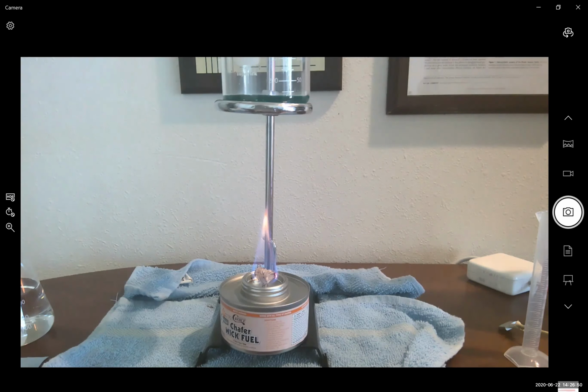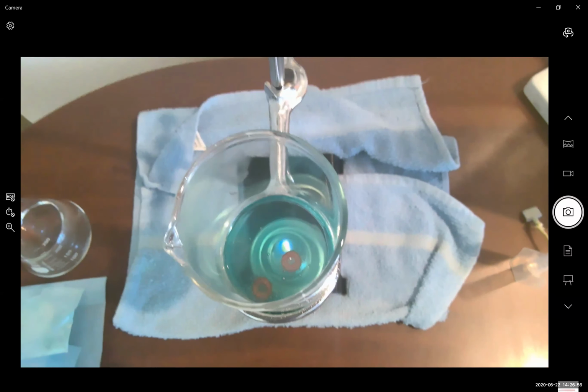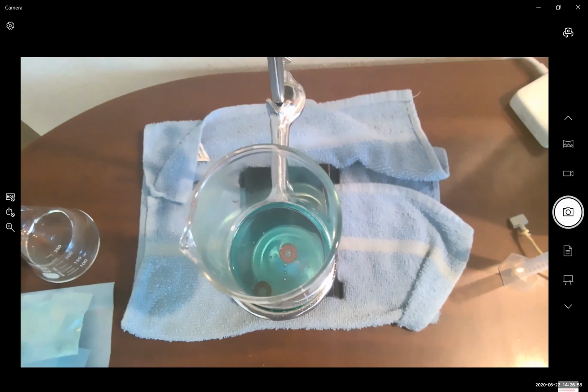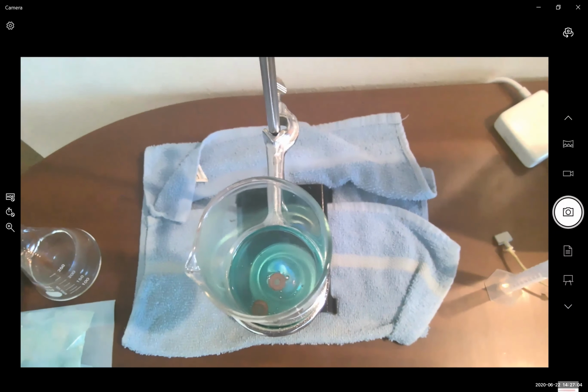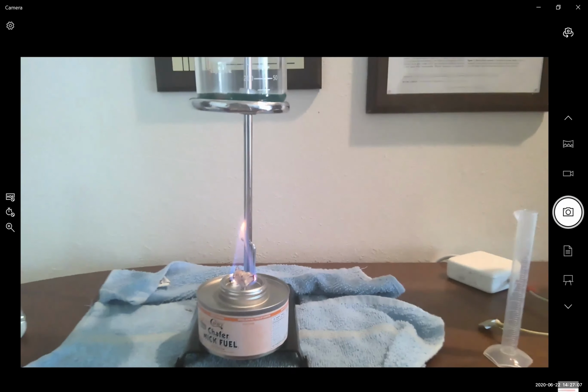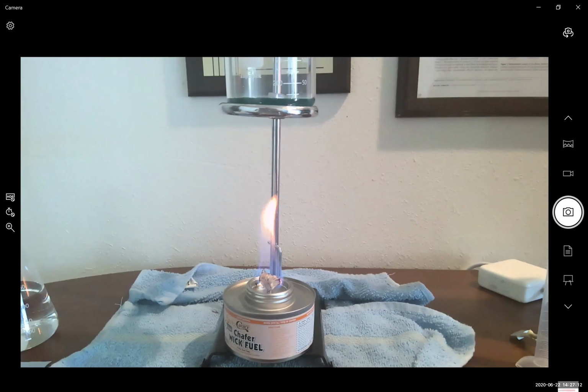And if there are any questions, now you may notice as well, this is really bubbling now. It's not boiling. This is from the reaction, and we clearly see the evidence of a chemical reaction on the surface of each of our aluminum washers. We don't have to worry about the mass of aluminum. It is used in excess in this experiment. And the washers serve a twofold purpose. They serve as a copper capture mechanism. The copper will stick to the aluminum surface as it's generated. And it serves as our reducing agent. So it's quite a cleverly designed setup.